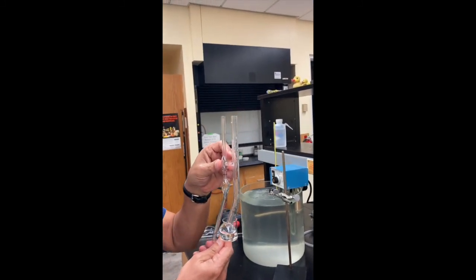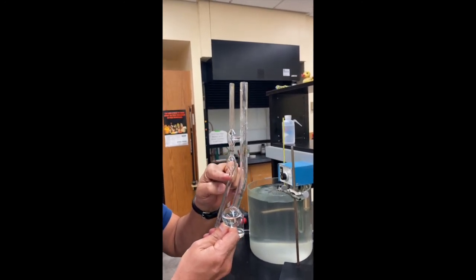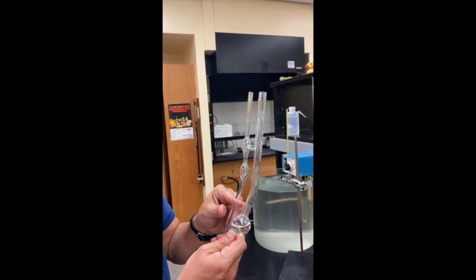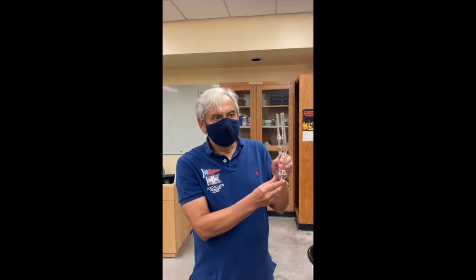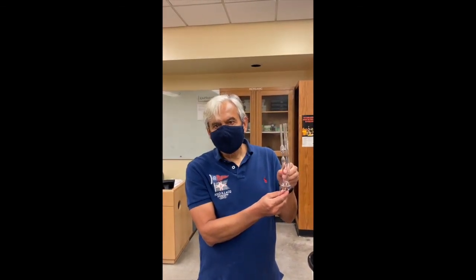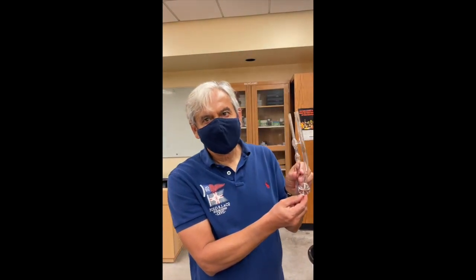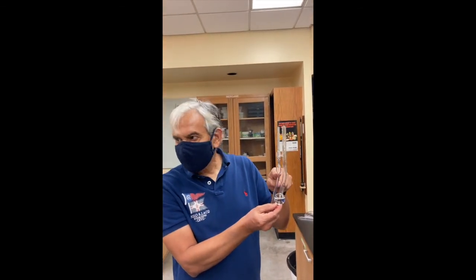And another important thing: when the solution is concentrated, there is a higher probability to clog the pores of the tube, and in such a way upset the time measurements. Therefore, when you have your 4 solutions ready, it is recommended to measure them in the order of increasing concentration and average mass. So you start with the less concentrated cleaved solution, then the less concentrated uncleaved solution, then the concentrated cleaved, then the concentrated uncleaved, so that the most concentrated solution is measured last.